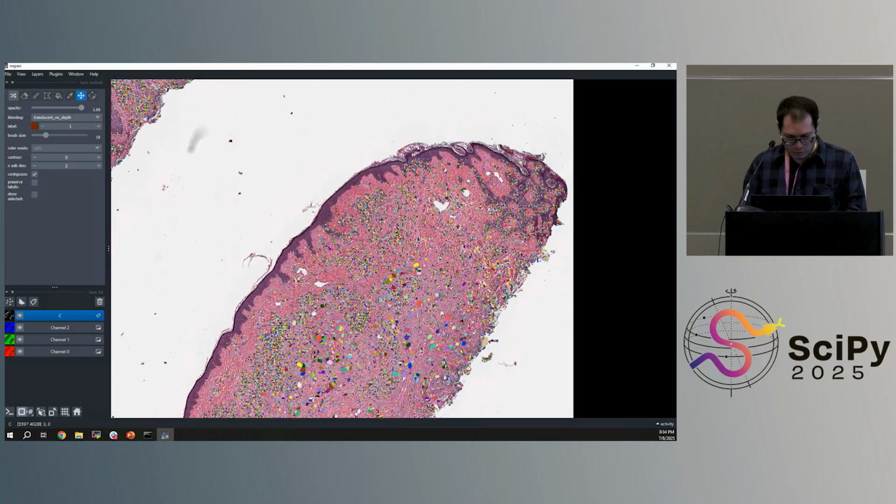So I hope it makes sense when we implement this. We check if there is, inside of worker, an attribute that is called cellpose_model. And if not, let's create a cellpose model with the specifications that we passed. This is only going to happen once. It's going to be cached for each of the workers, so each worker has an existing cellpose model. Because it's inference time, we don't need to update the model, so there is no risk in applying that. It is the same model for each worker. The only difference is that we don't have to pass that through the network every time.